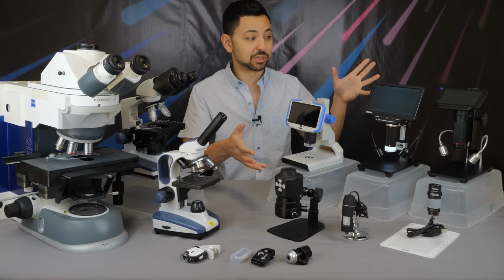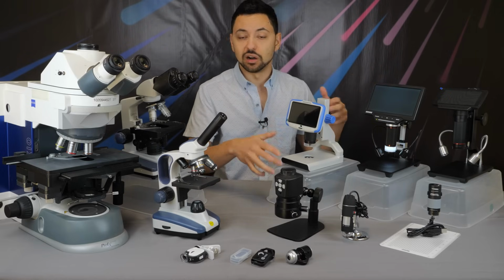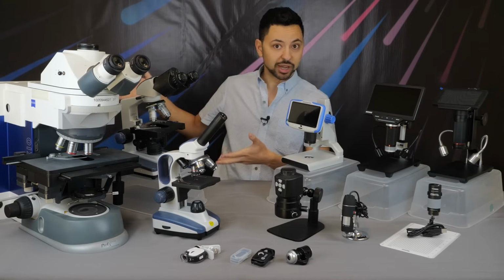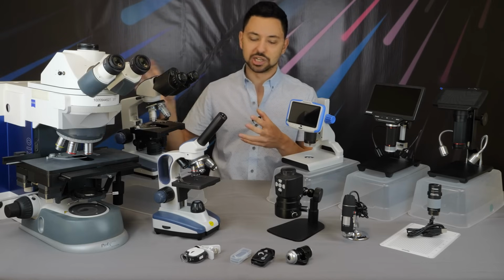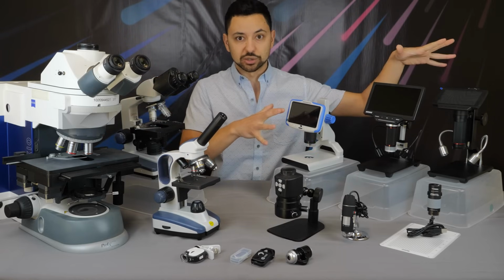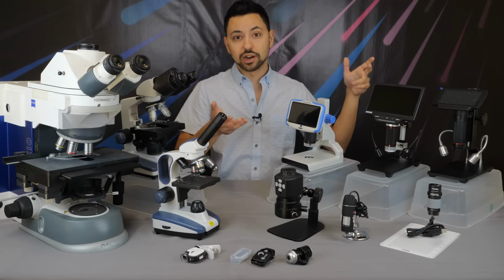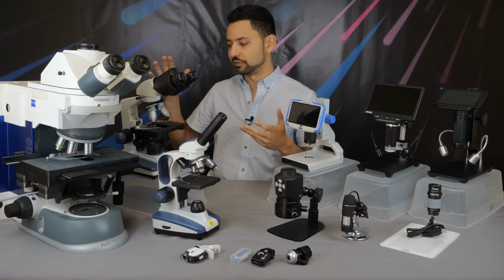I end up using digital microscopes for, I would say, about 60-ish% of what I'm trying to look at on a weekly basis. So something common that I might look at is, for example, if I am building out a new prototype of the Micro Safari kit and I need some kind of a breathable membrane material that is gas exchange for the organisms, and I need to identify what kind of plastic it's made of, I'll use my digital microscopes because they're so fast to set up and give plenty of magnification for most of my applications. And I can just put it under there and figure out, okay, is it a woven fabric? Is it non-woven? Is it flash spun? Whatever I need to figure out with that.